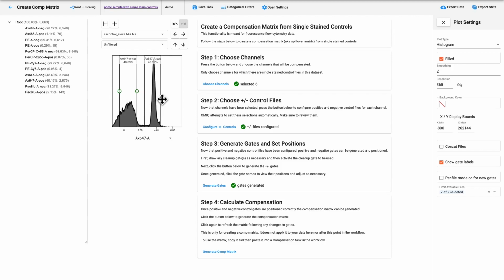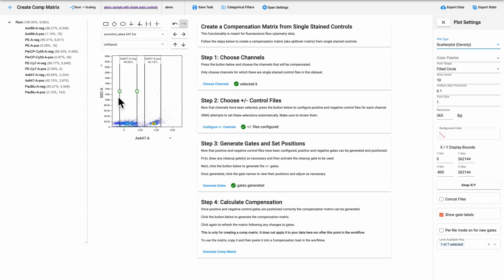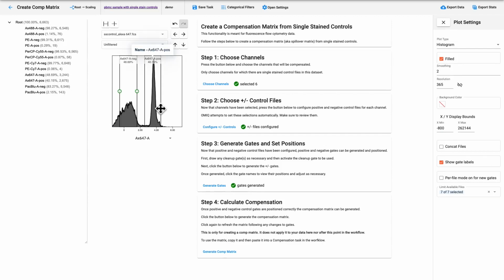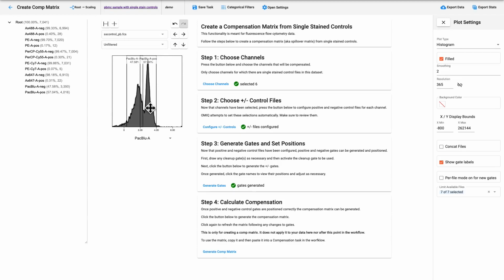If it helps, at this point what you can also do is select a different plot type. Keep in mind that this selection will be temporary. The minute you go to some other plot type again, it will try to force it to a histogram. Okay, and then we're moving on to the last one, setting this appropriately. And that's all we need to do.